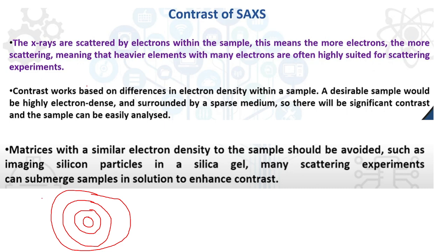Now when a beam is incident and it ejects this inner shell electron, a vacancy is created when one electron is ejected from this shell. To fill that vacancy, another electron from this orbital will come down here. When it comes here, obviously it must release the energy difference. How it releases that energy depends on the nature of the atom. If this is a heavy atom, that energy will be higher and it will be released as an X-ray.